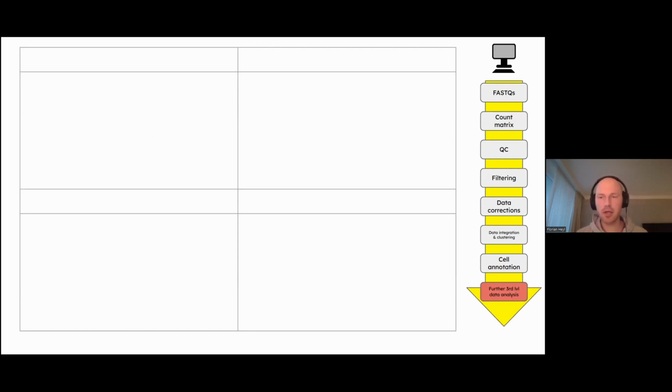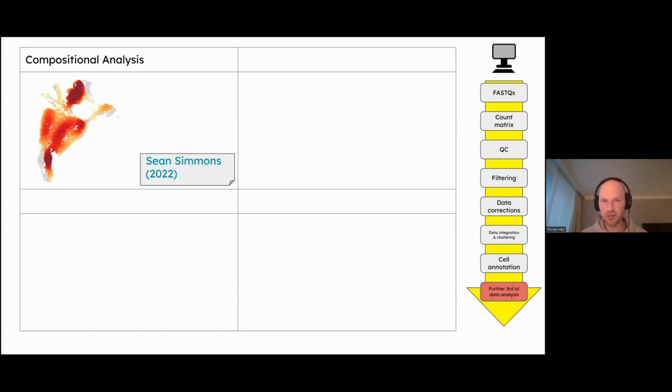Now, the last part, and now I go into what you can do further. Obviously, there's a wide spectrum of what you can do, and I will cover here 4 additional things you could investigate. First thing is compositional analysis.